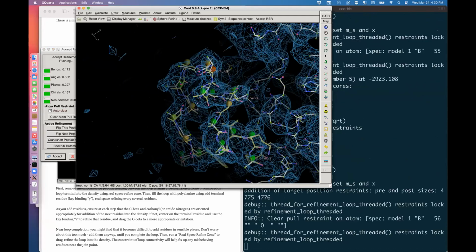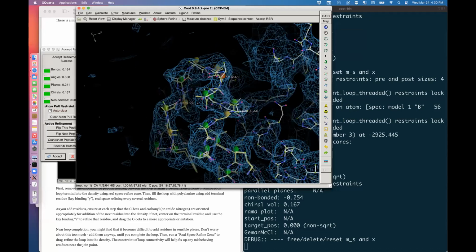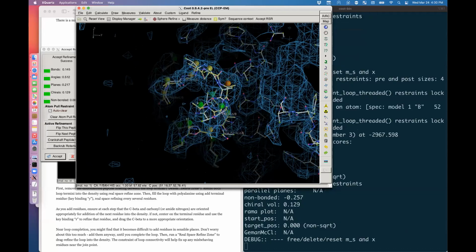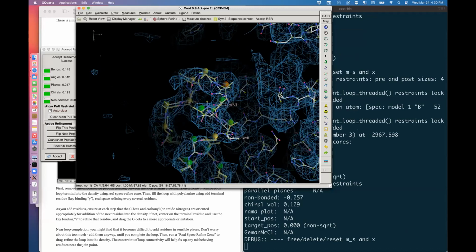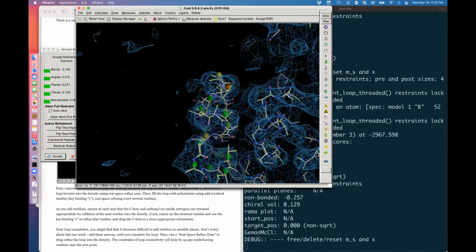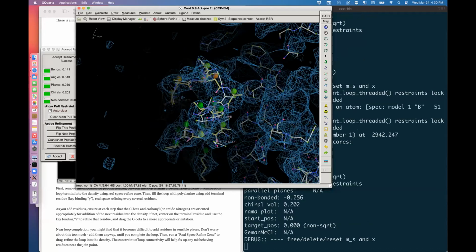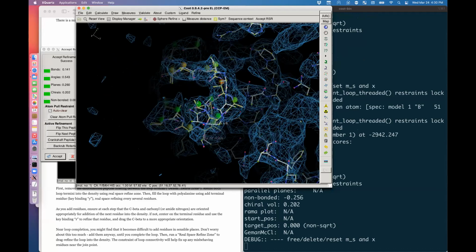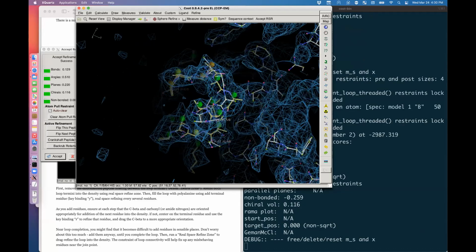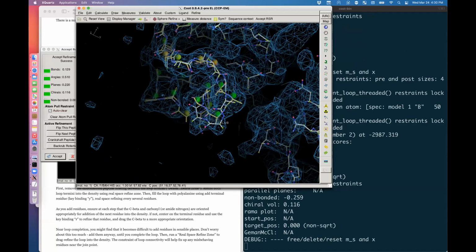You can see that a lot of the little balls here are, yeah, so now we fix that up a bit. Everything's a bit happier. Getting there. Maybe this guy should be around like that. Not sure. There. And so on. Okay, so that's building a loop.